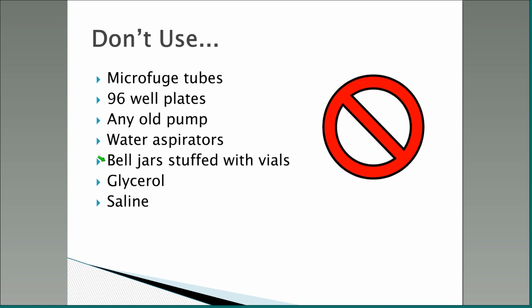Some people will think that glycerol or saline is a good idea with freeze drying, since glycerol is good for freezing. Glycerol doesn't vaporize, so it will gum up your sample. And saline, such as PBS or whatever, you'll end up with a lot of salt, and the salt is bad for your sample. So these are things which you don't want to use.